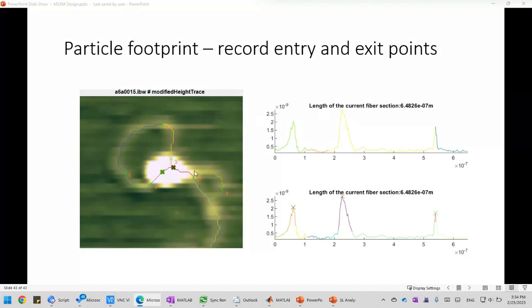That's important because now imagine if the protein binds to a specific sequence of the DNA, right? So simply knowing its peak location does not give us the accuracy of where it binds on the DNA, right?